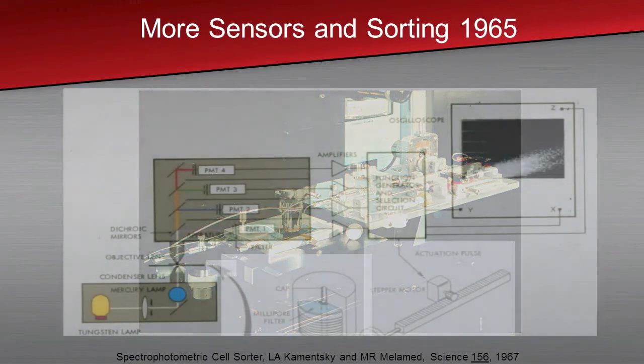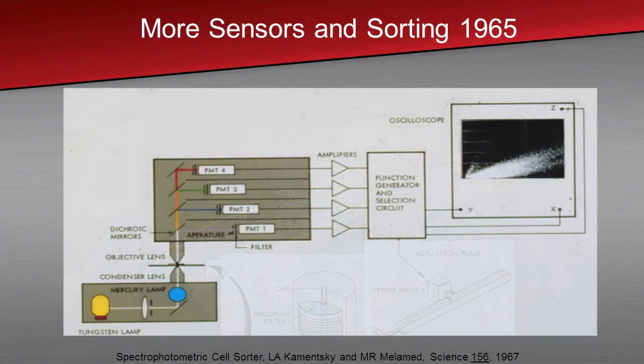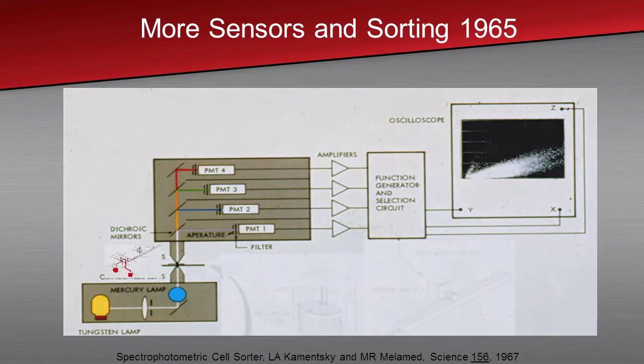We had looked at droplet sorting. Pap smear cells are big, and they clump together, and they just don't lend themselves to droplet sorting, so we abandoned that technique, unfortunately. That became the standard for flow cytometry, and I actually have an early patent on droplet sorting as well, but not as elegantly as later. I'll show it, Fulwyler did it.